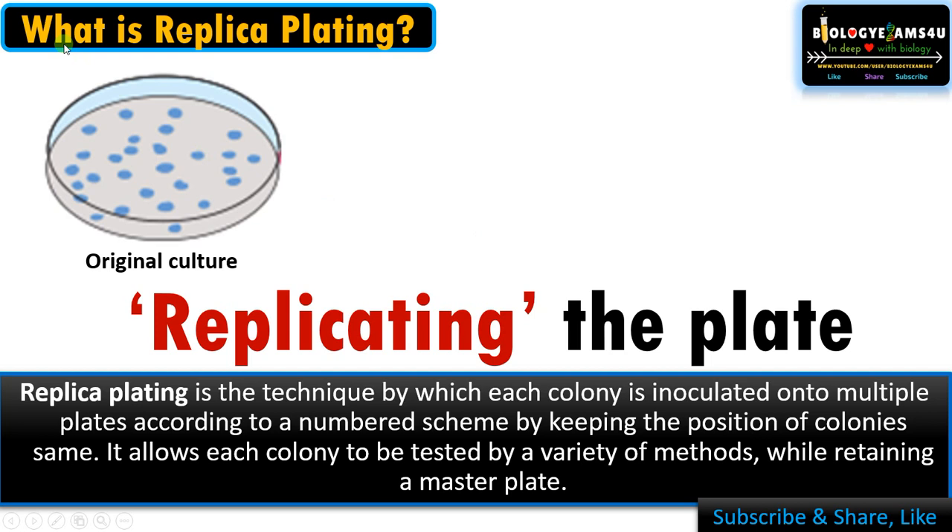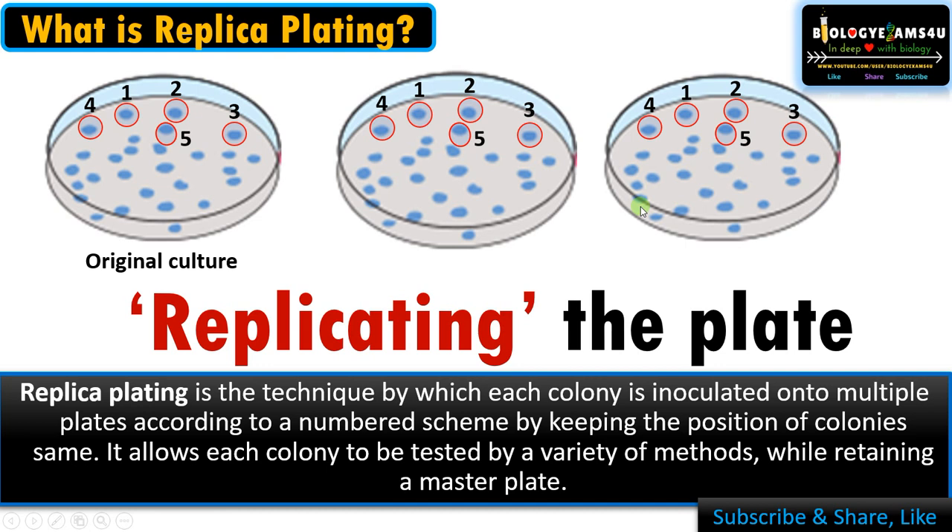That means numbering the colonies — colony number one, two, three, four, five — while keeping the position of colonies intact. These are the secondary plates after replica plating. As you can see, the position of the colonies remains intact, the same as compared to the original master plate.